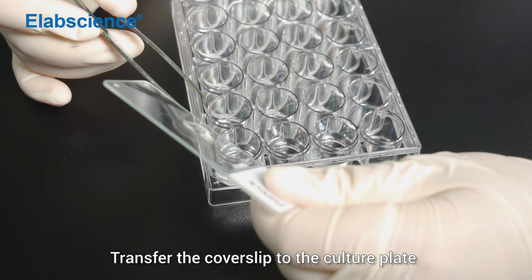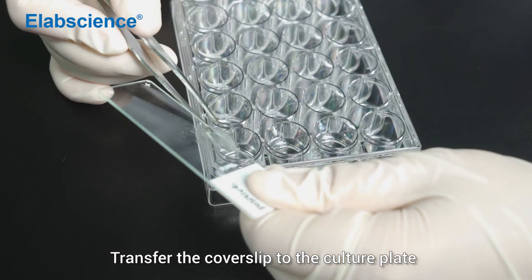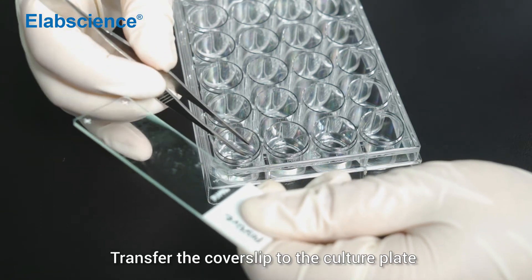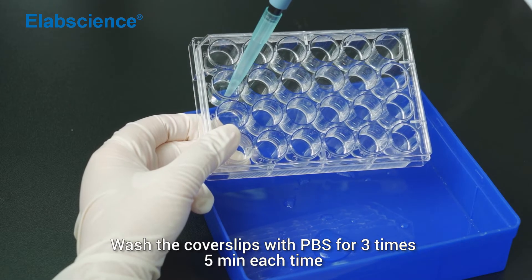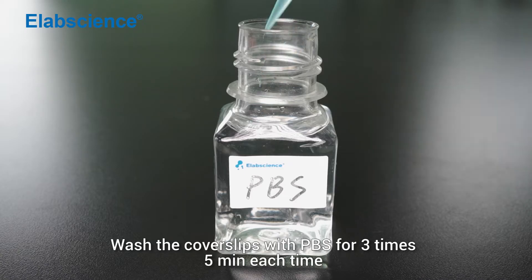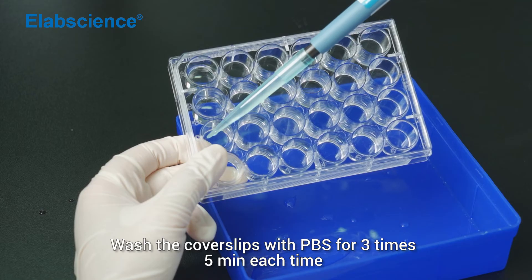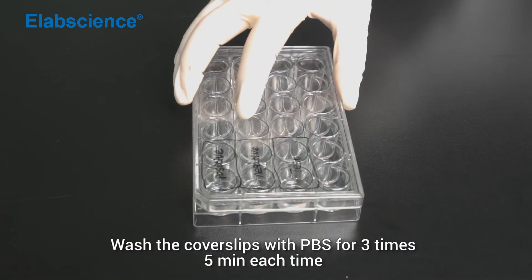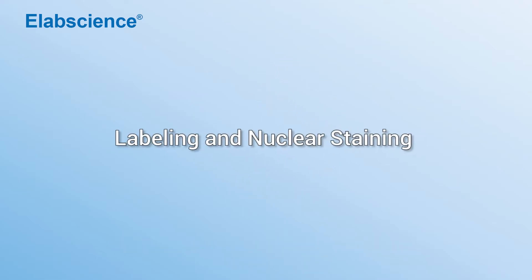Transfer the cover slip to the culture plate. Labeling and nuclear staining.